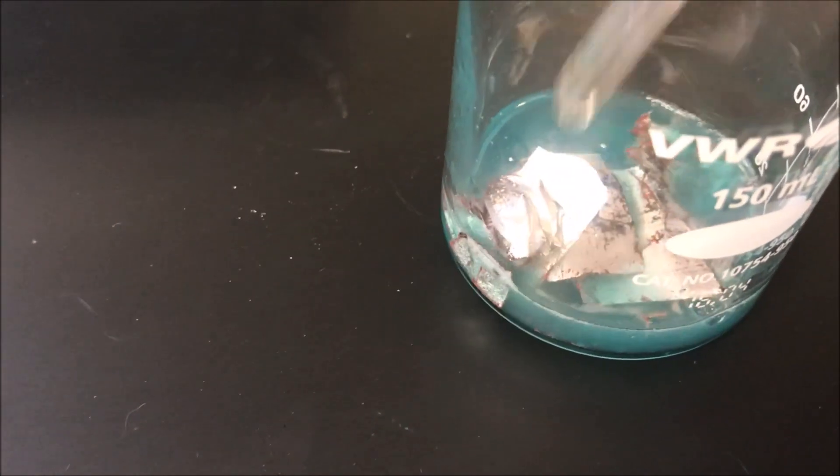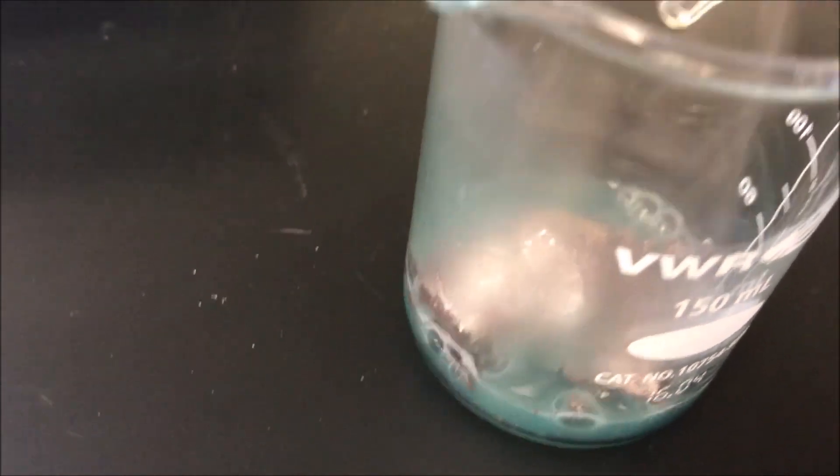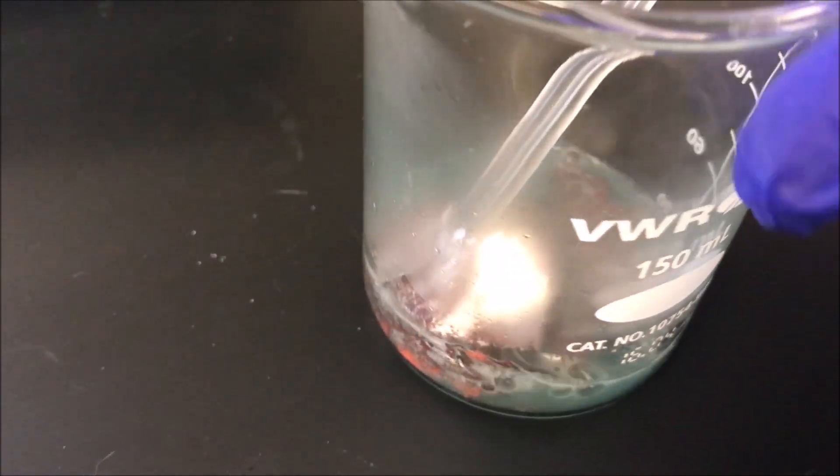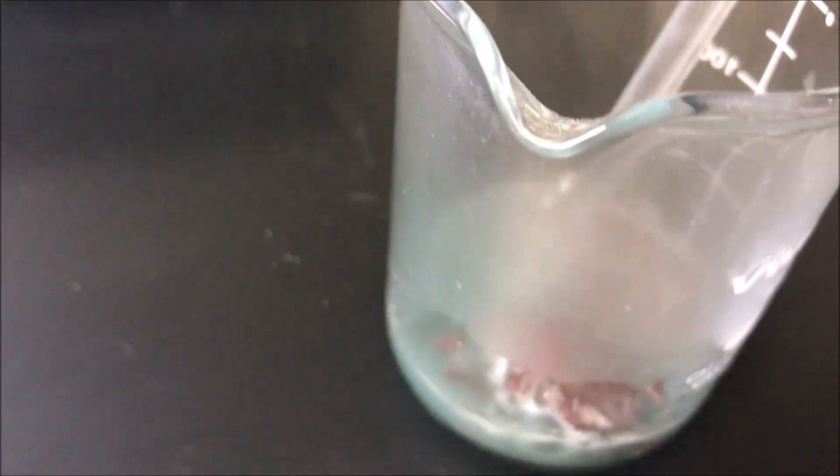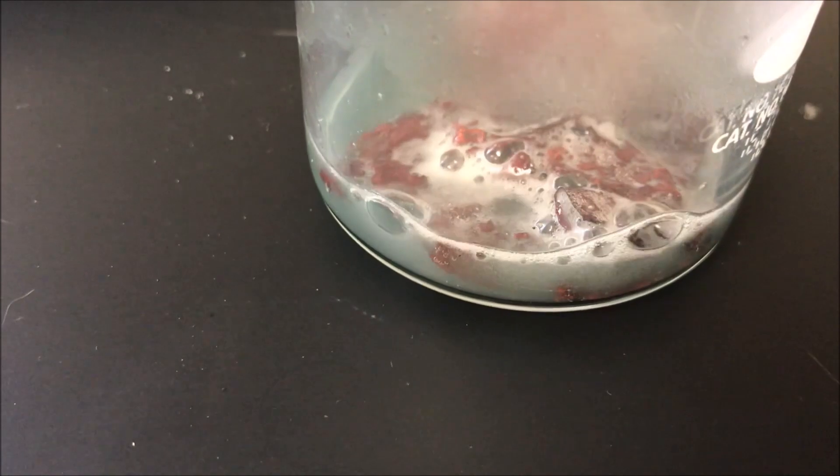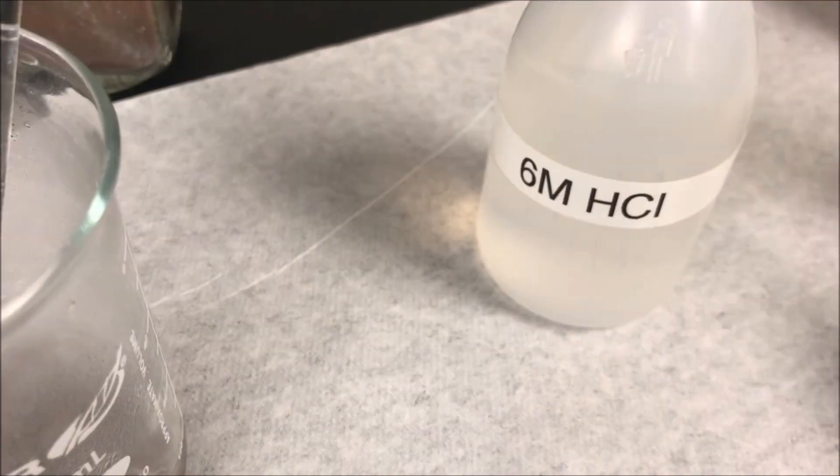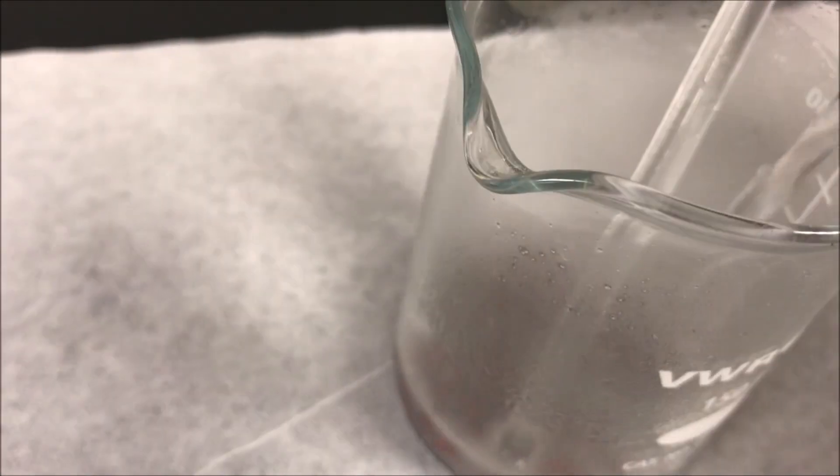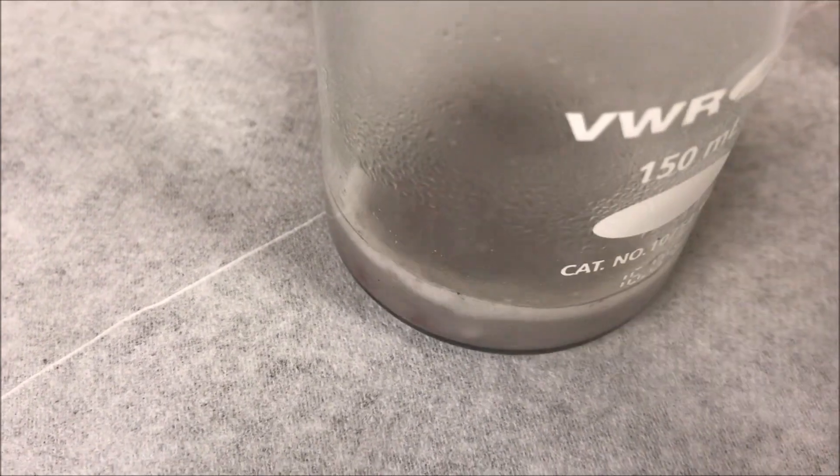Use the stirring rod to mix the solution. It's an exothermic reaction. If any aluminum foil remains, we can add 5 ml of HCl hydrochloric acid to make the reaction complete. I have a few more aluminum foil pieces remaining.